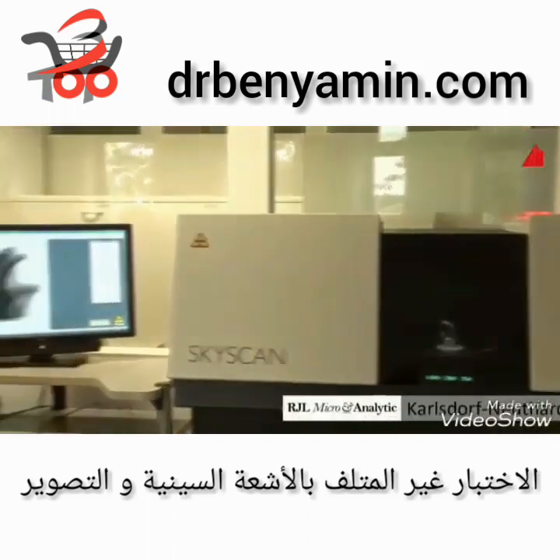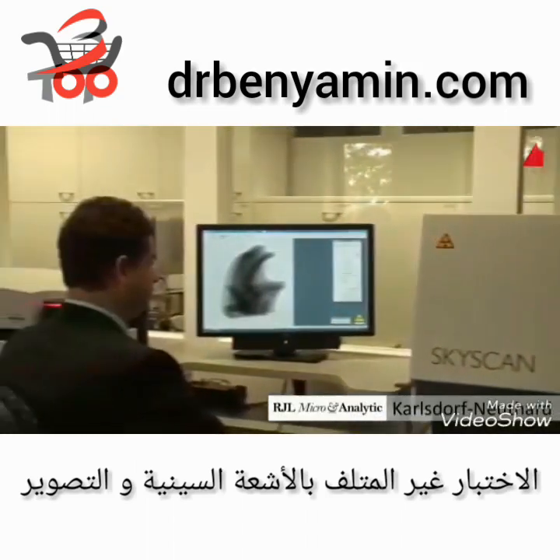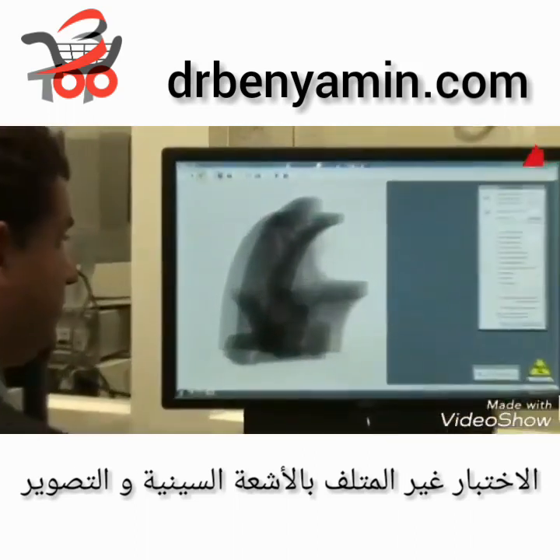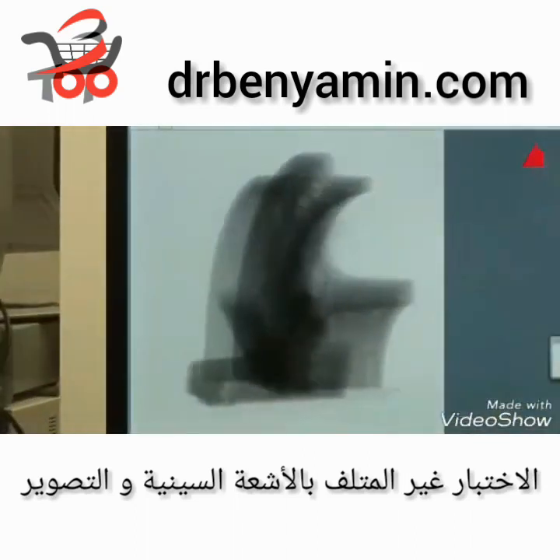X-rays are frequently used in non-destructive testing of materials as well. The inner contours of complicated workpieces can be made visible, and of course defects, such as cracks and pores.